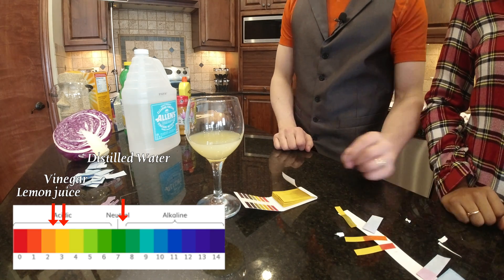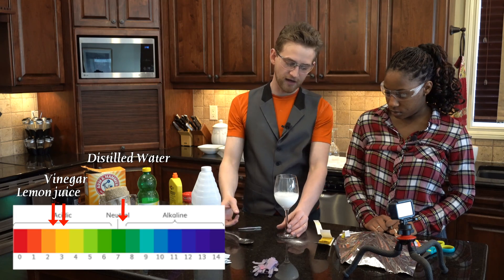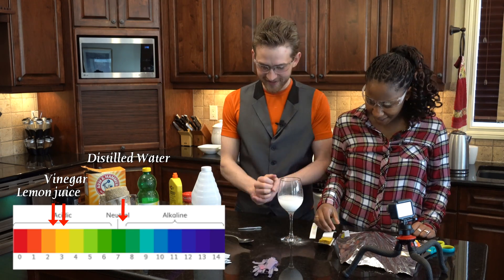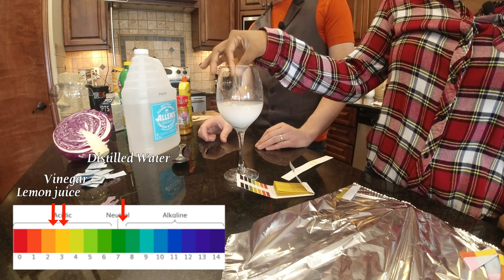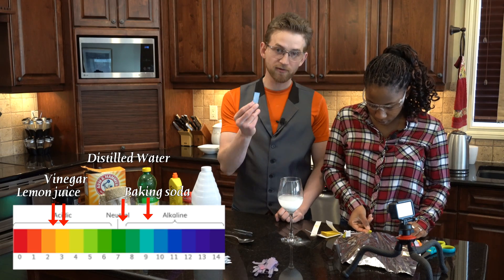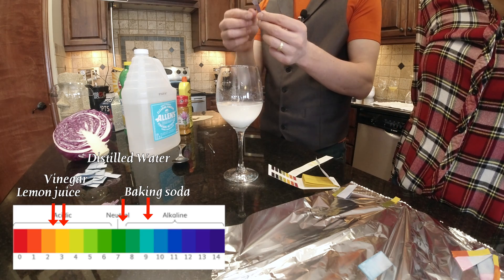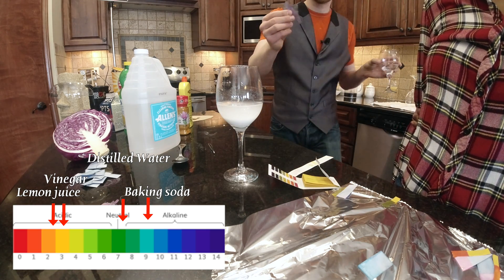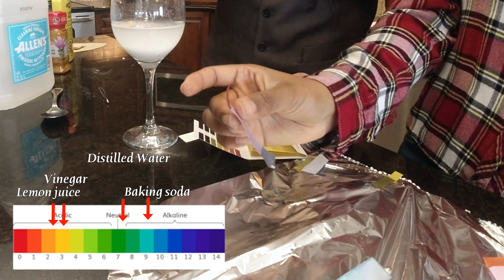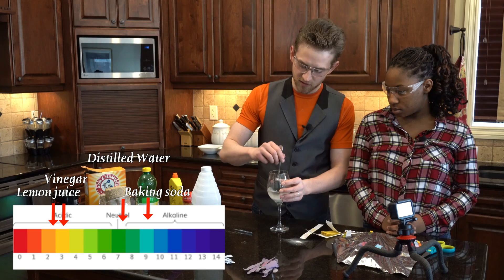Now let's try something basic. We're going to mix in two tablespoons of baking soda to distilled water. I love my wine glass full of baking soda with my cabbage soup - makes me feel high class. So according to this, this should be a darker color. That's green, so it's a nine on the pH - fairly basic. Before, when it was an acid, they turned kind of a pinkish purple. So we'll see what happens when we put this in with the cabbage strips. That definitely turned darker. Just to show this is actually working, I'll dip the other end into the vinegar to give you the color difference. Looks like for homemade litmus paper, acids turn it kind of a red, and bases turn it a blue.